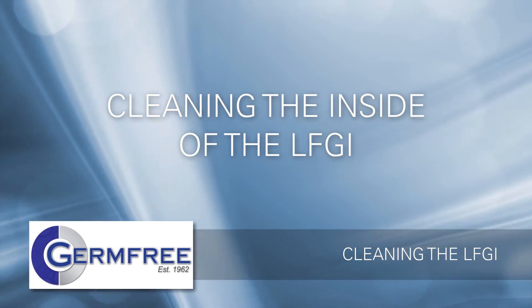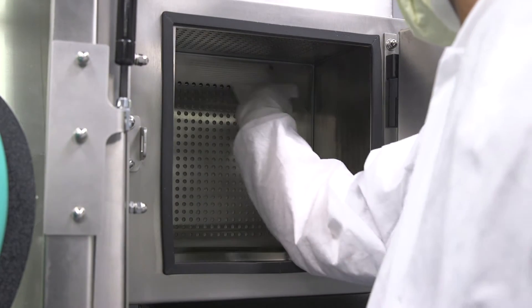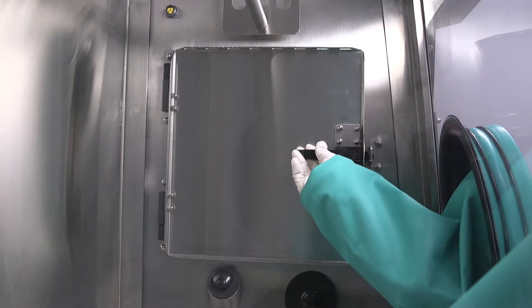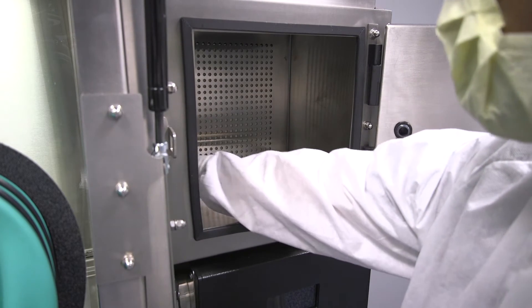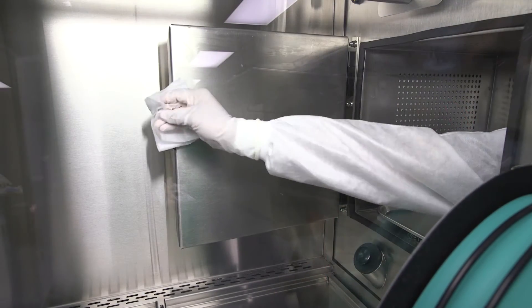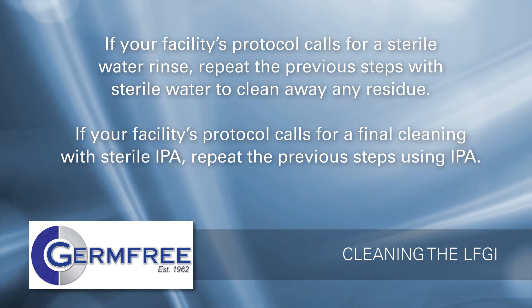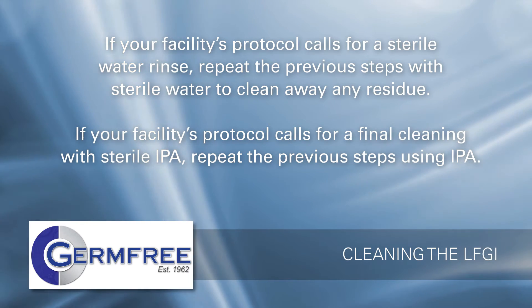Once the outside of the unit has been cleaned, you are ready to begin cleaning the inside of your LFGI. To clean the airlock, complete the following steps: Clean the top HEPA filter protector with a disinfectant wipe. Wipe the back HEPA filter protector, then both sides of the airlock. Clean the inside of the outer airlock door. Open the airlock door that leads to the work area and slide the tray out into the work area. Clean the bottom filter of the airlock normally covered by the tray, then the tray itself. Slide the tray back into the airlock, then clean and latch the inner airlock door. If your facility's protocol calls for a sterile water rinse, repeat the previous steps with sterile water. If your protocol calls for a final cleaning with sterile isopropyl alcohol, repeat steps 1 through 6 using IPA.